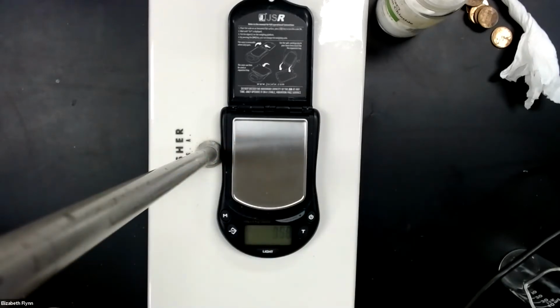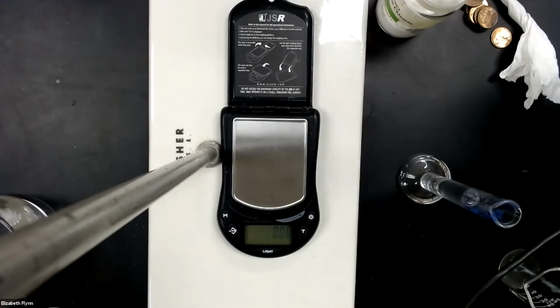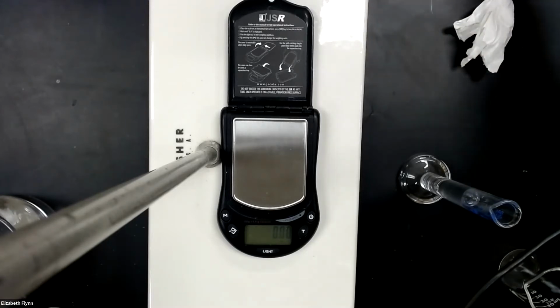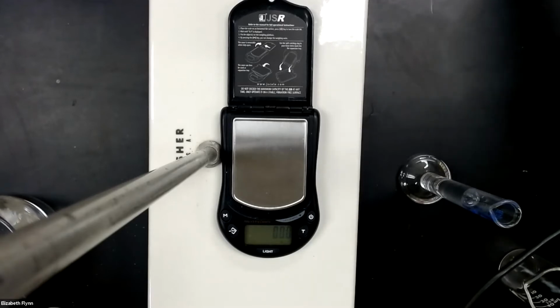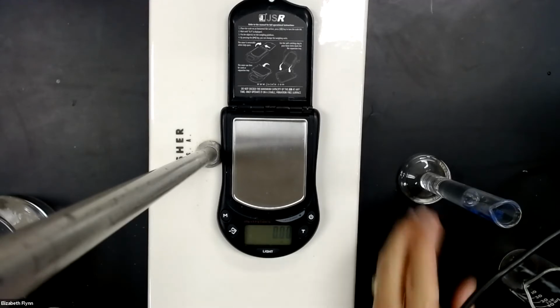So I will do that. About 9 milliliters of water. So why do you not need to add exactly 9 milliliters? What's more important instead? Think about that. What's more important is that you actually write down the precise volume, and that you get the actual mass. It's not as important how much is actually in there. It's more important that you write down the correct measurement.